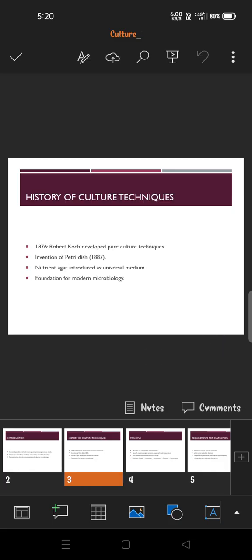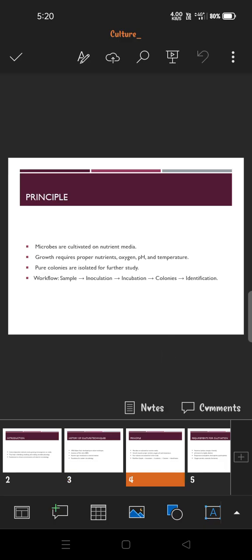History of culture techniques. In 1876, Robert Koch developed pure culture techniques. In 1887, the Petri dish was invented by Julius Petri. And as we all know, nutrient agar was introduced as a universal medium, and it was the foundation for modern microbiology.